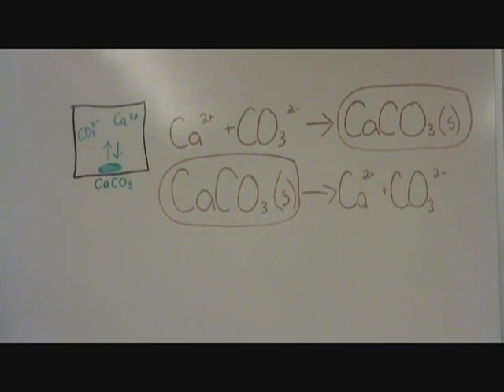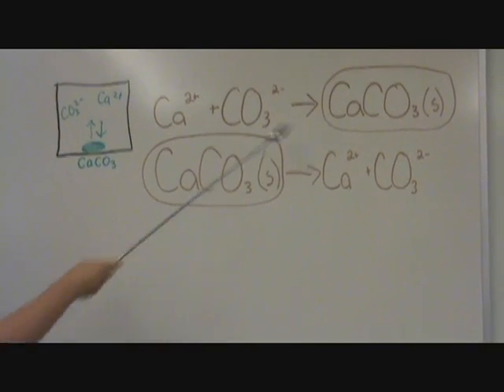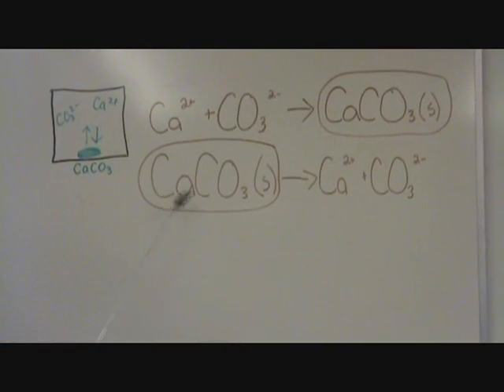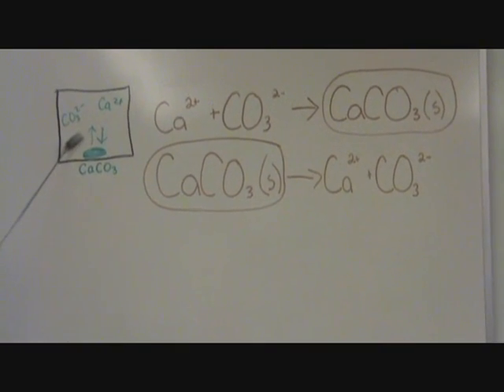Many of us have also learned that all starting materials in a reaction eventually go to products, but the truth is that most reactions are reversible. For example, in our experiment, there is both a forward and a reverse reaction. The reaction is at equilibrium when the forward and reverse reaction rates are equal.